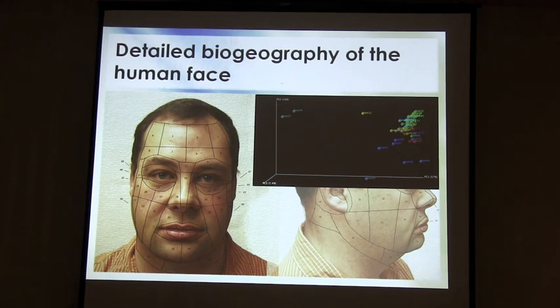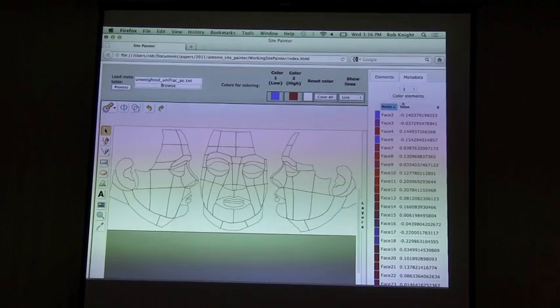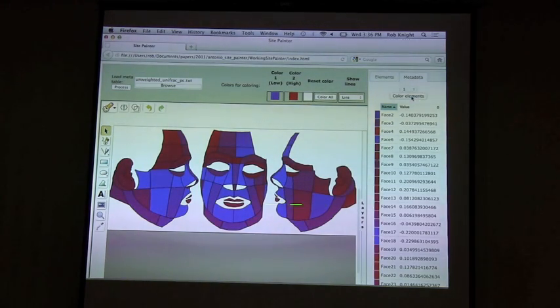What you'd really like to do is just draw a map of your study site, whether it's your face or a house or a city or the continent of North America, and just paint the information on there directly. So Antonio developed a software called SitePainter that lets you do exactly that. For example, if I color the face by PC1, you can immediately see the left-right symmetry, which you really couldn't see in that plot I showed you before.